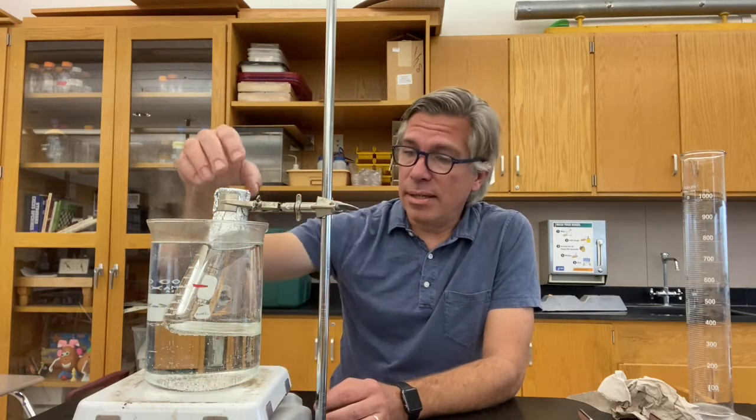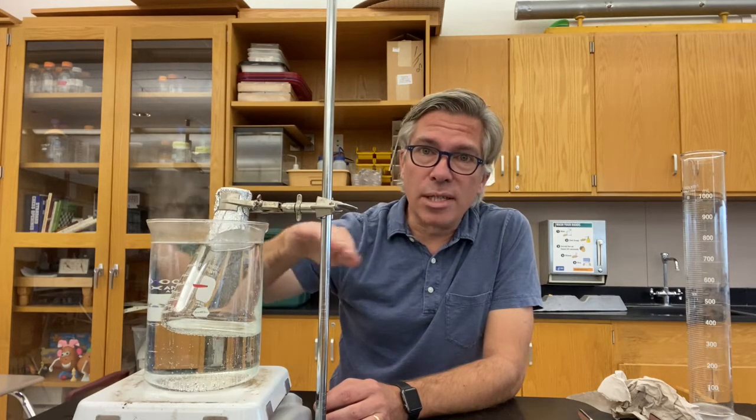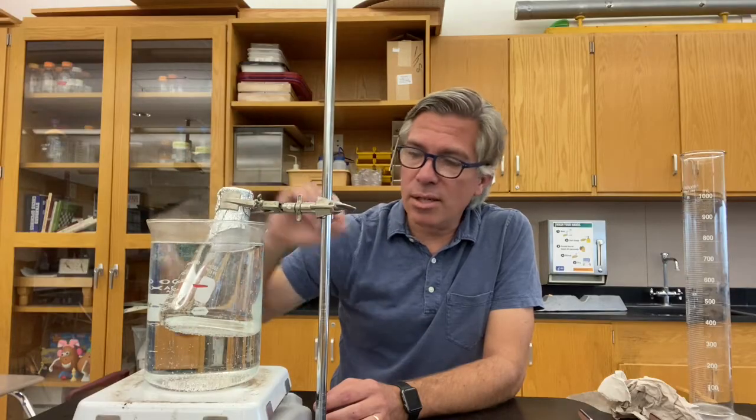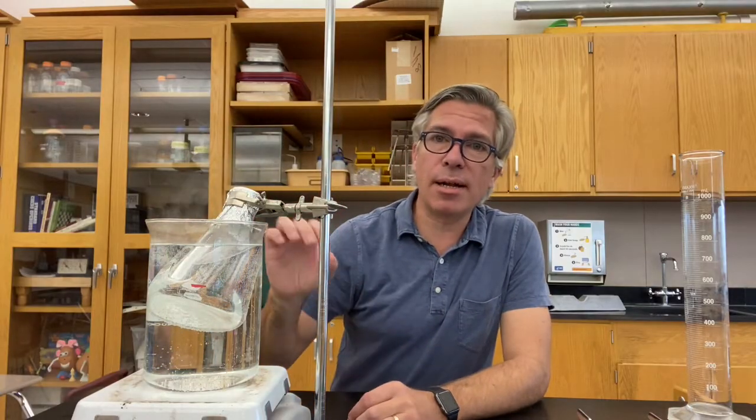So I recommend giving it a little jiggle here and there. Oh, and when I see the jiggle, I can see my volatile liquid moving back in there. And I want to keep jiggling it occasionally until I stop seeing that little jiggle. All right, and now that my liquid has completely evaporated, I'm going to take it out and set it on the countertop to let it cool.